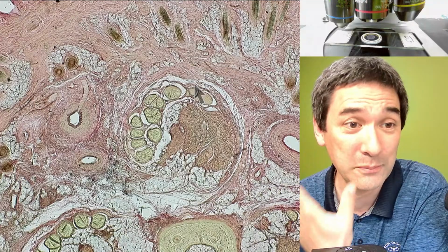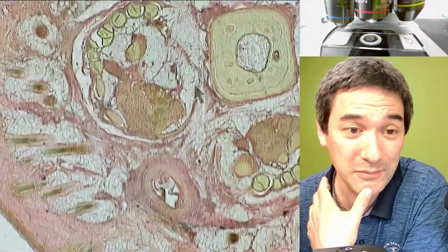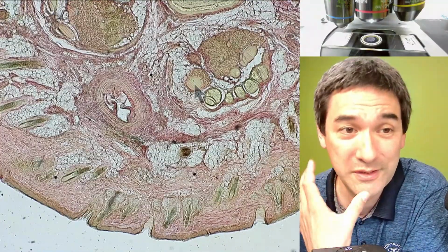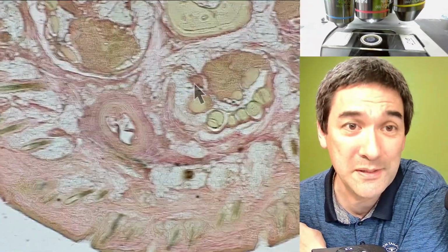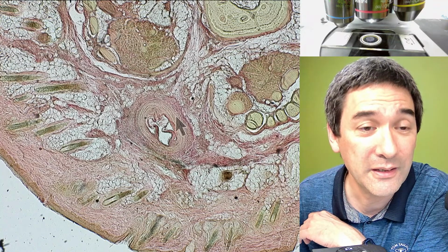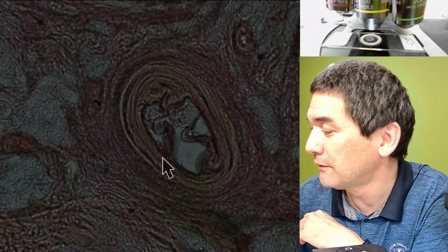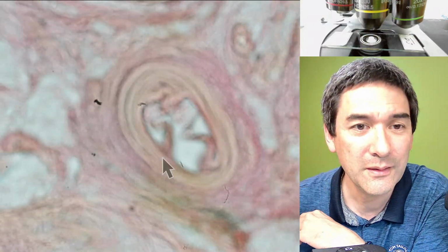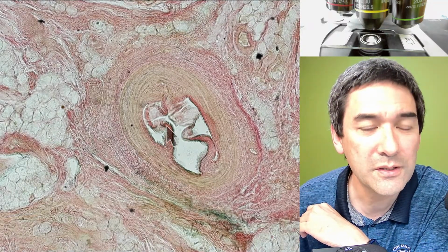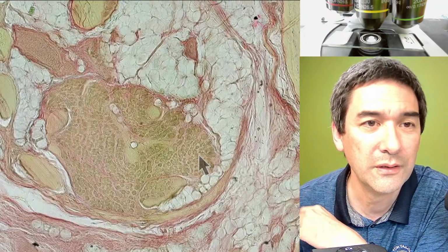Again, 100 years old, properly prepared, and still very usable, obviously, and a very nice histological sample because it shows so many different tissue types. And again over here you see that this again is a blood vessel, in cross section. So we can actually go a little bit up in magnification if you want to. And you can see that the endothelium started to separate a little bit here due to the preparation. Here, muscles again.